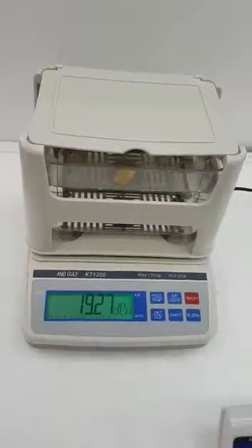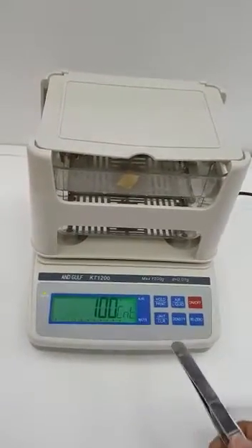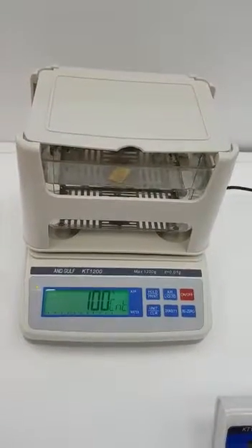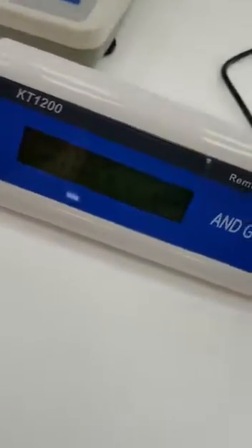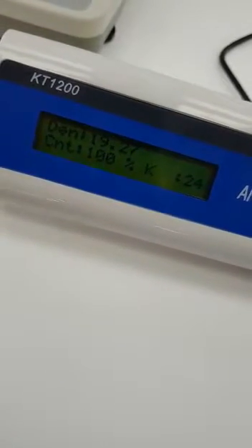This is the density of the material, and this is the percentage — it's 100% pure. It will also tell you if it's 19%, 85%, or 50% purity. You will also get the remote display for the customer to show them the percentage and all the information on the screen.